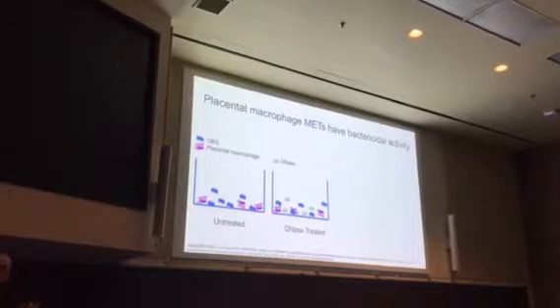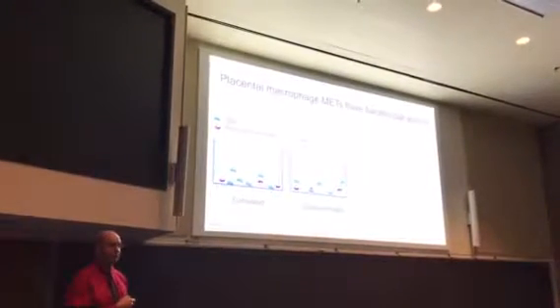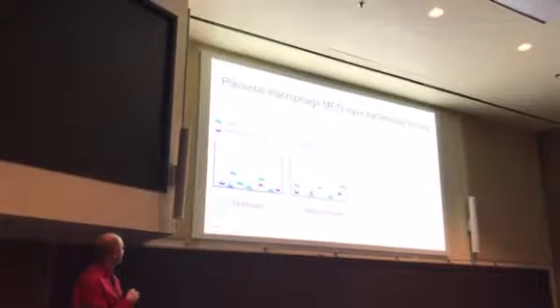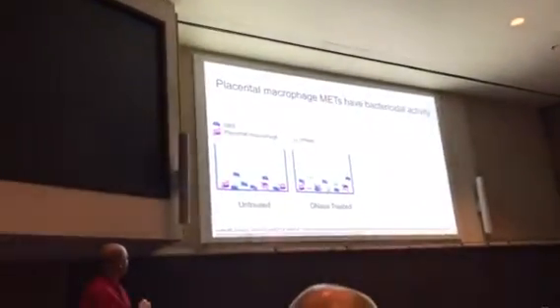The next question was, well, these structures seem to be extracellular traps. Can they actually kill bacteria? And so to find this out, we did a killing assay where I set up two parallel systems. In one, we're going to infect macrophages with GBS, and they'd be expected to release their extracellular traps. In the second, we're going to leave DNase in the system to degrade those structures.